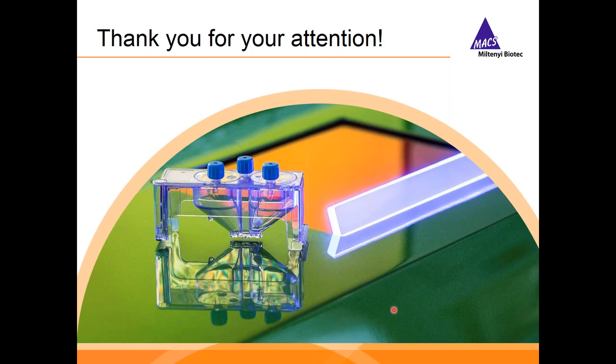That's actually what is the maximum amount you can put into a cartridge. That's 500 million cells. Okay, and a related question is how fast can you sort them? Okay, yeah, also an interesting question. So we run this current cartridge design with 4 milliliters per hour.